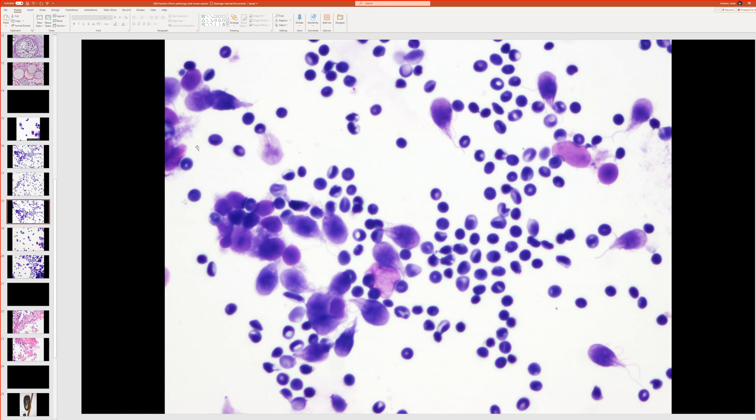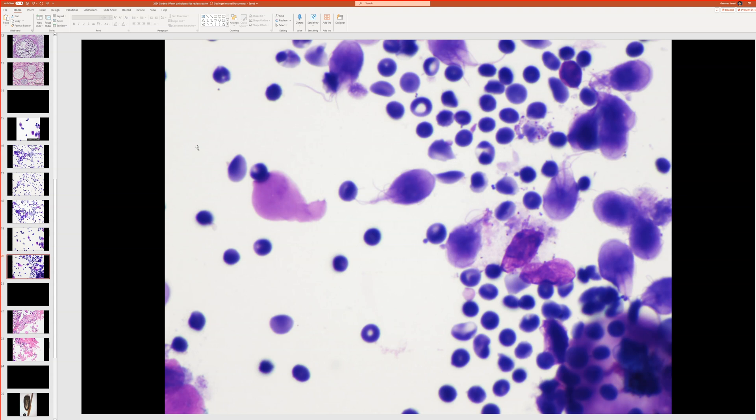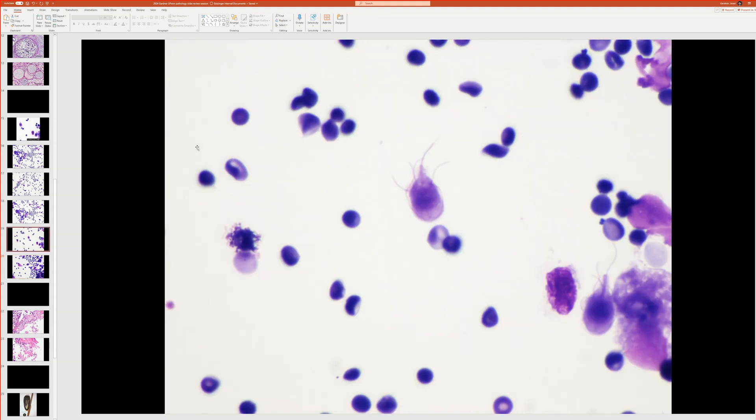This is Giardia. So anyway, how did this preparation get made? Does anyone know? It's kind of cool. You can do it in your own lab if you want.